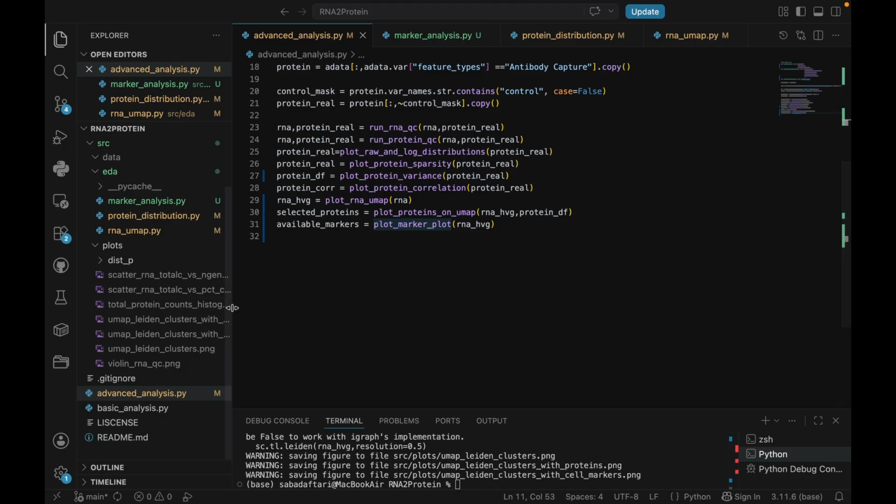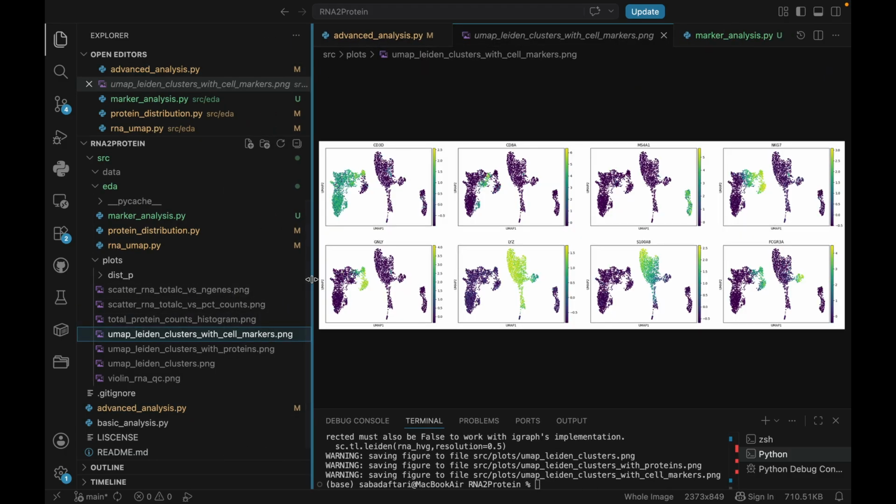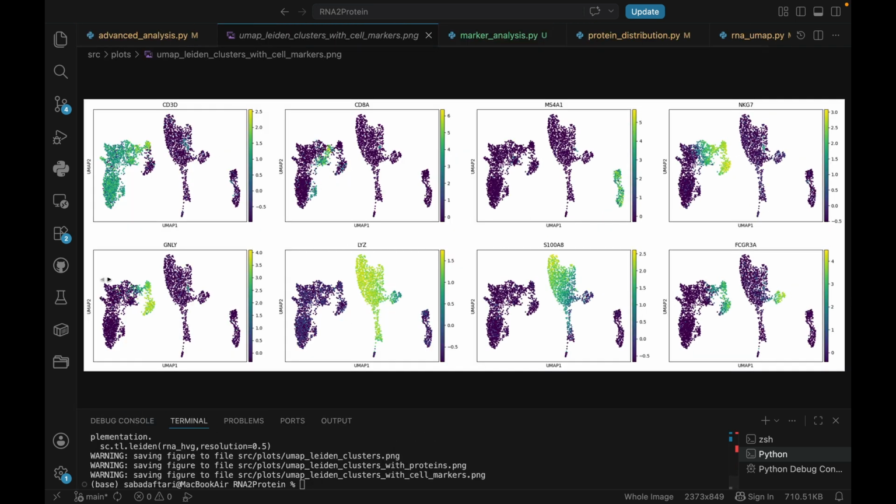So let's take a look at the results. Okay, so if we just look at it at first glance, these two really look alike, as the left blob and right blob are dark purple and the middle one is kind of yellow.